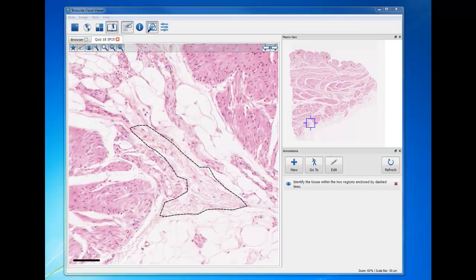I want to give you a few tips in preparation for the midterm by using some of the previous questions. At the outset, I'm just going to demonstrate some interaction with the virtual slide specimens in Part B, so that if you're failing to do some maneuvers that are very important, you will not forget to do that.